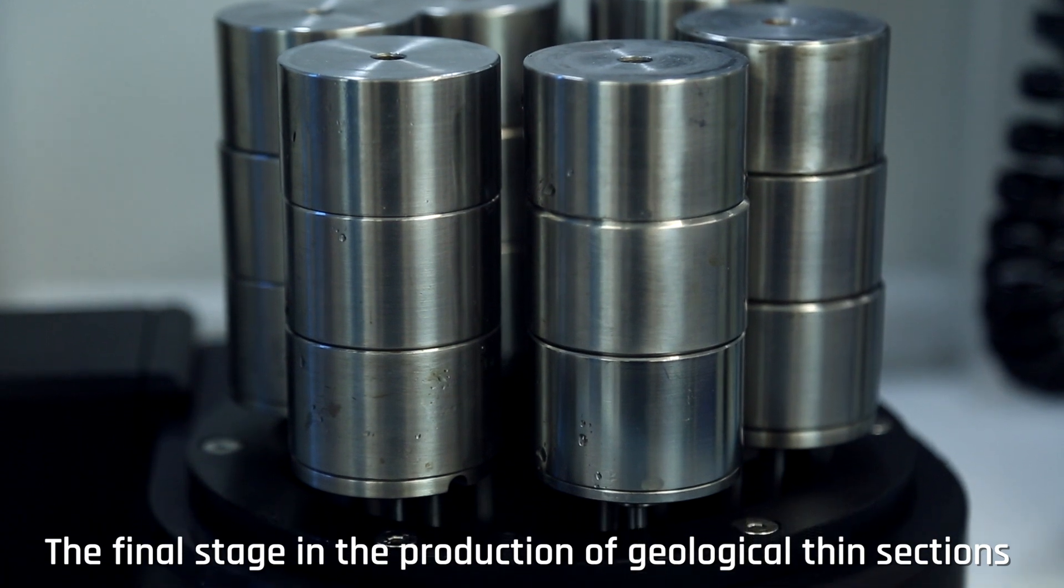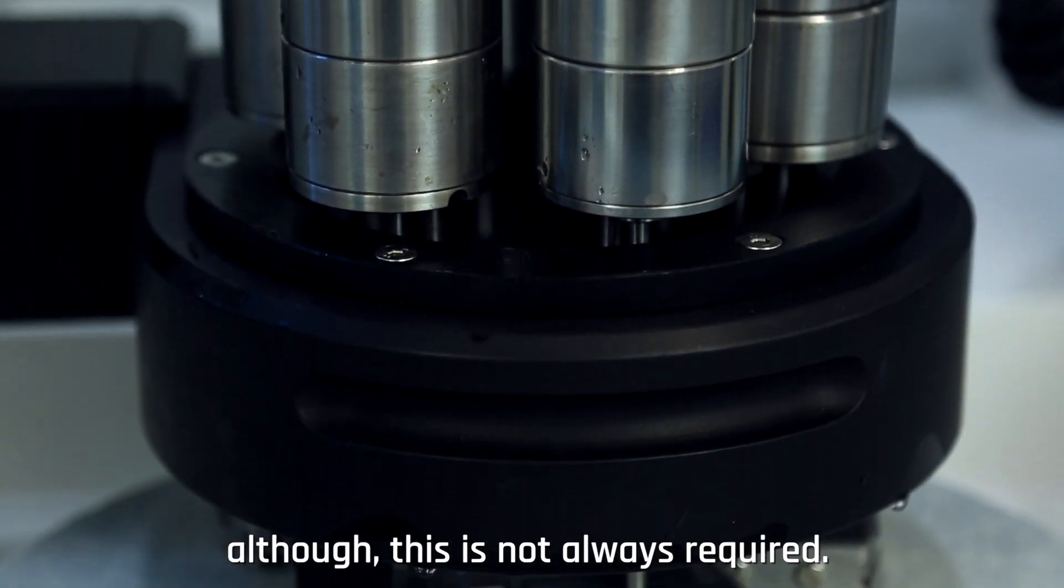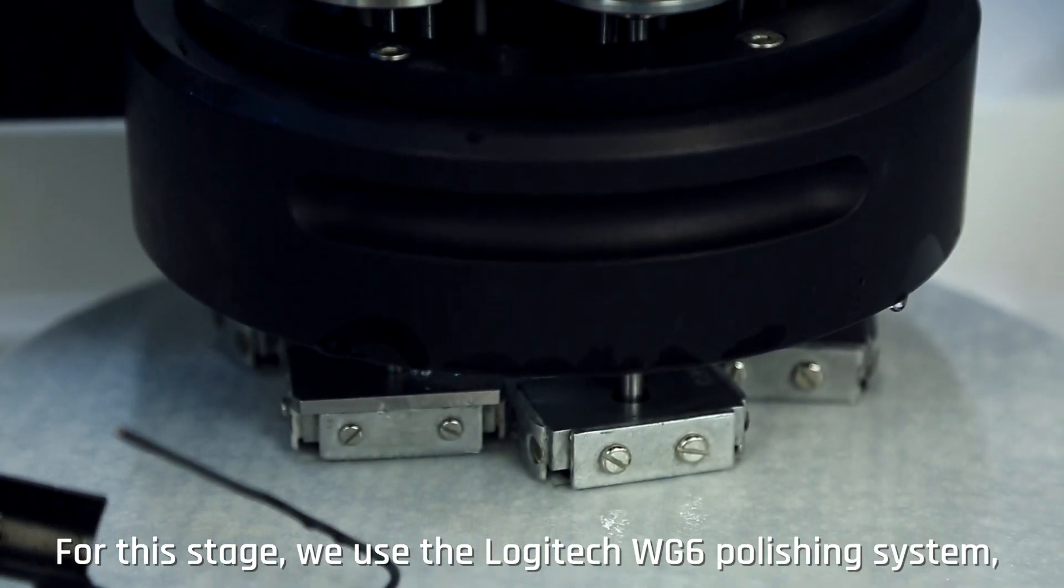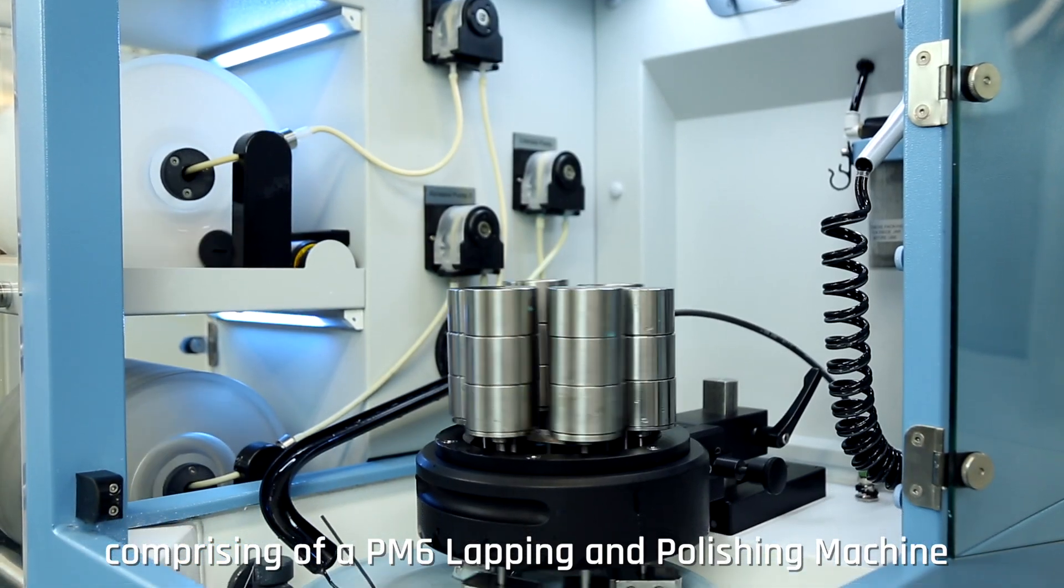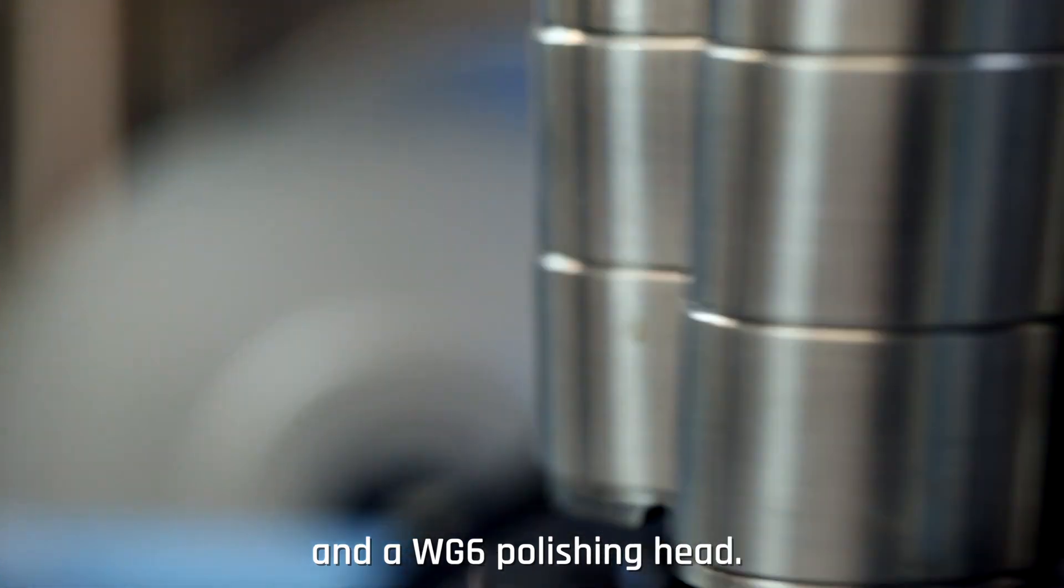The final stage in the production of geological thin sections is to polish the specimens, although this is not always required. For this stage we use the Logitech WG6 polishing system, comprising of a PM6 lapping and polishing machine and a WG6 polishing head.